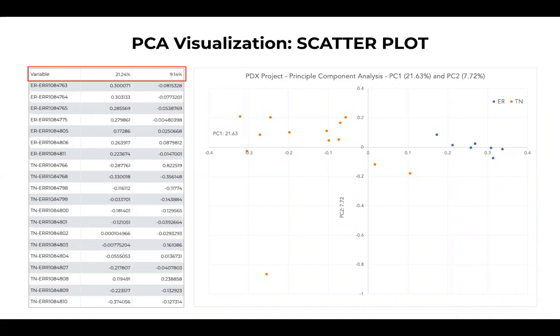So we usually look into PC1 and PC2 and plot it, and also PC3 and plot it, because PC1, PC2, PC3 capture most of the data. We did this in the last class, and we can visually see this, right? You can visualize your data by assigning coordinates to each sample based on principal components that best explain the variance of our data.